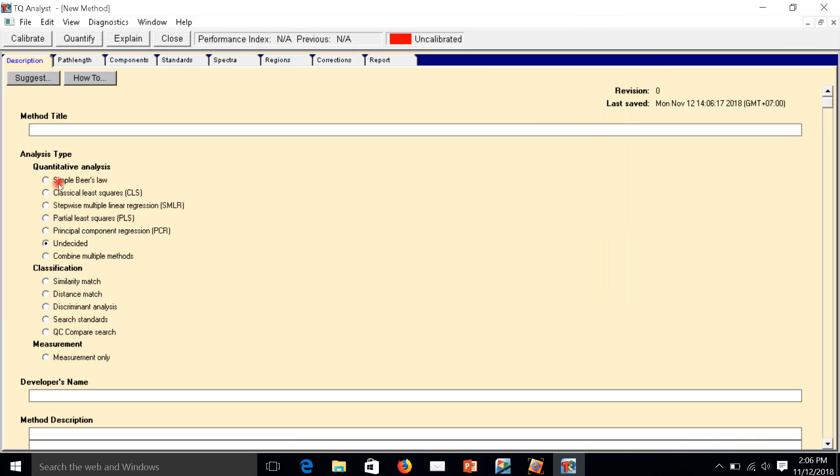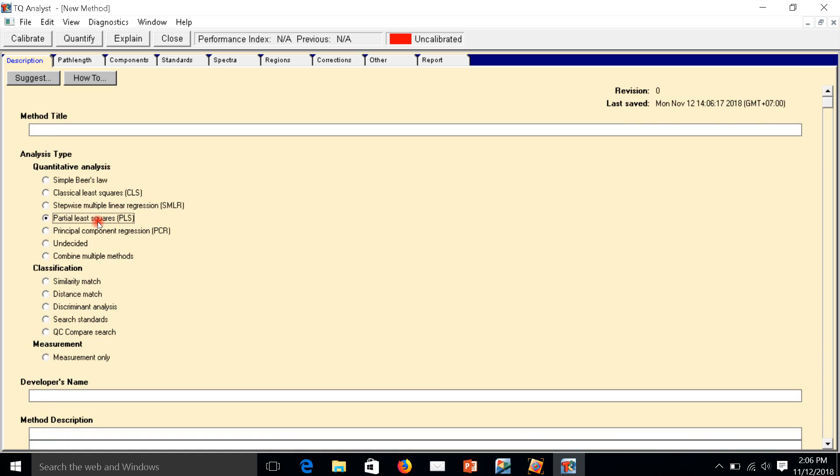Here we have to choose PLS, this one, Partial Least Squares. This is the method we are going to make.